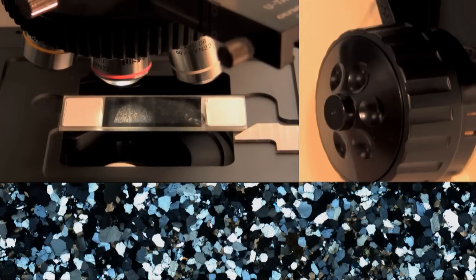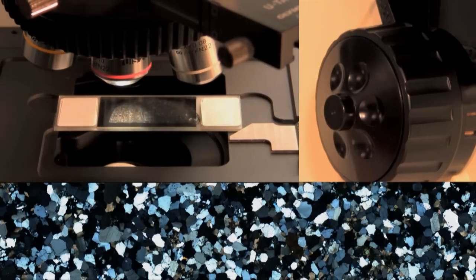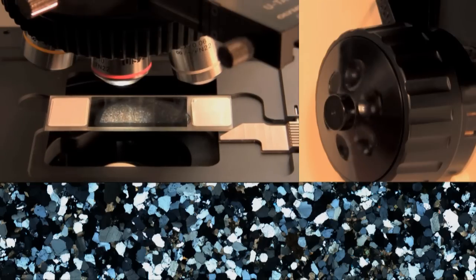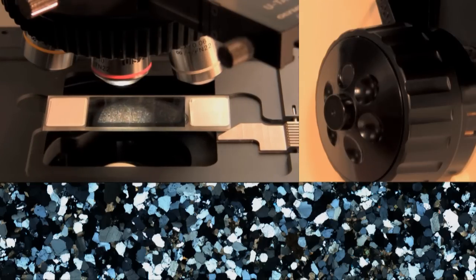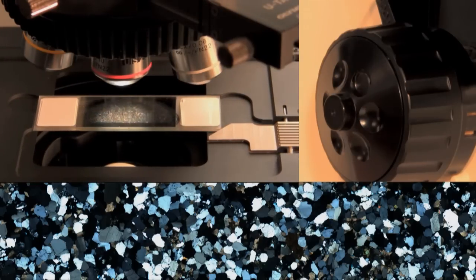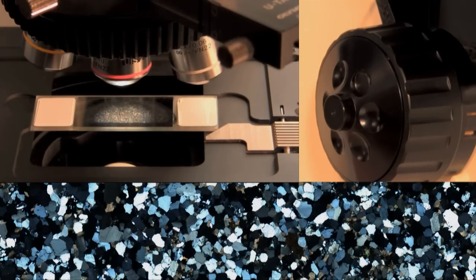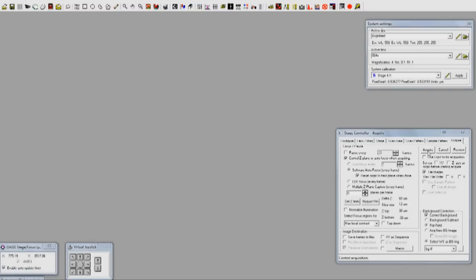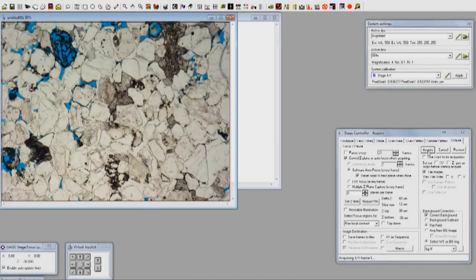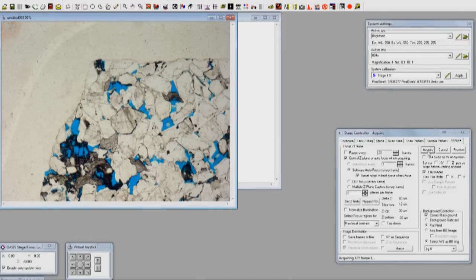Typically, the thin section is run twice, to image both polarized and cross-polarized lights, cross-polar being a full light extinguishment. Here, you can see the compiled image being created on the fly.